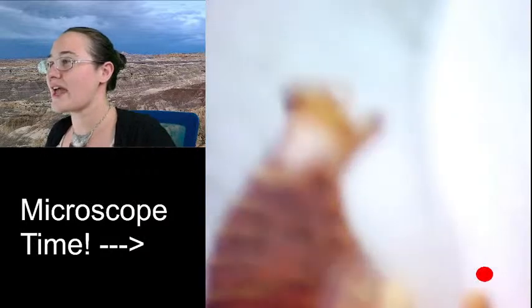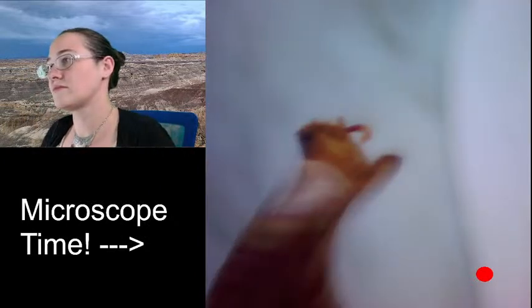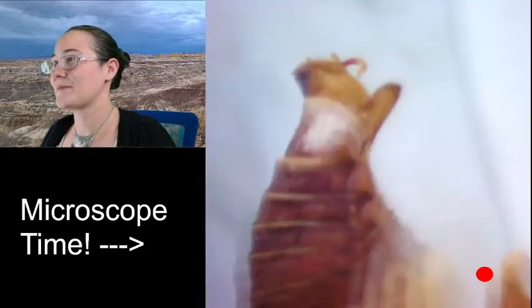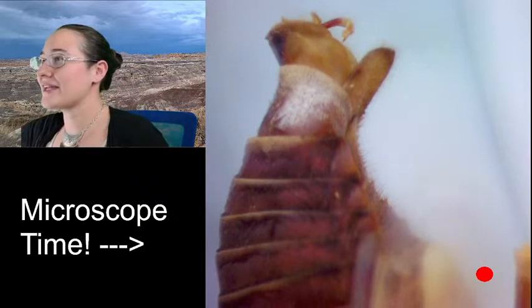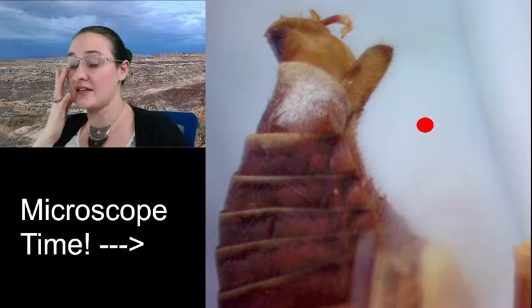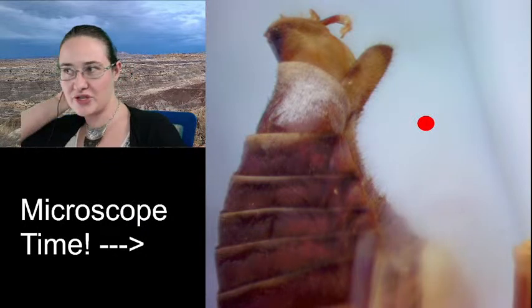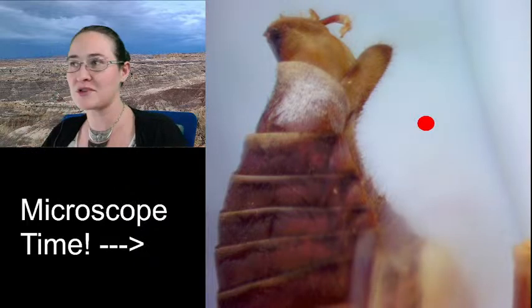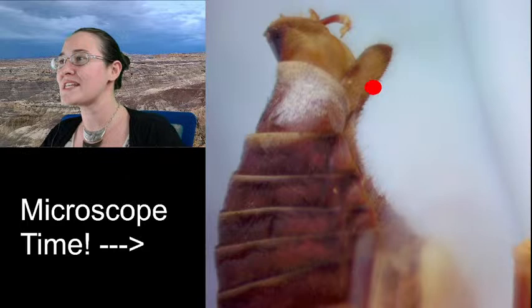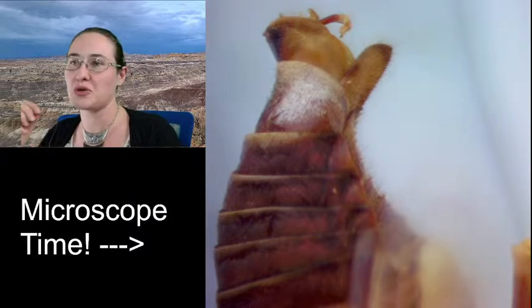All right, so this is a lateral view of the abdomen. A lot of times in cicadas, the females are going to have something called an ovipositor. That looks a little bit like a spear that comes out of one of their last abdominal segments over here. She uses it to pierce into the bark and to lay her eggs.